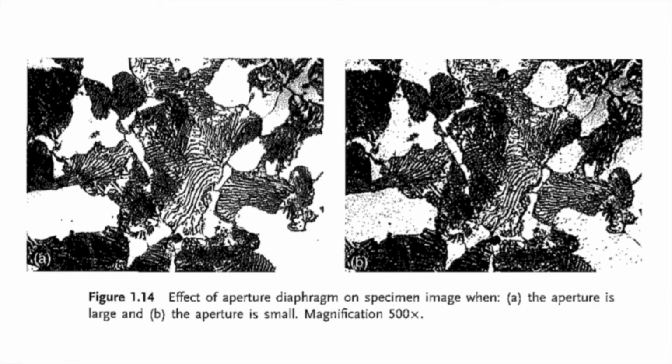That's what we can expect from the theory, right? We've looked at a lot of aperture angle. If we look at the equations for resolution and depth of field, what we see is that having a large alpha will give us better resolution. But as we know, the trade-off is that it lowers the depth of field.